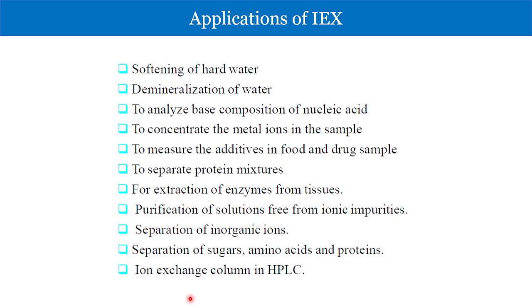So first what you do, go for an ion exchange or an affinity first, separate your protein out from a similar sized protein or the other contaminants, and then go for a size exclusion chromatography, resolve your protein from the bigger sized proteins, and you get a pure protein. So the ultimate goal is to get a pure protein, a pure substance, a pure macromolecule. That is what is important. It never minds in which pattern you go for a chromatography or which type of chromatography you are using. As long as you get your substance or macromolecule in a pure form, that's absolutely fine.